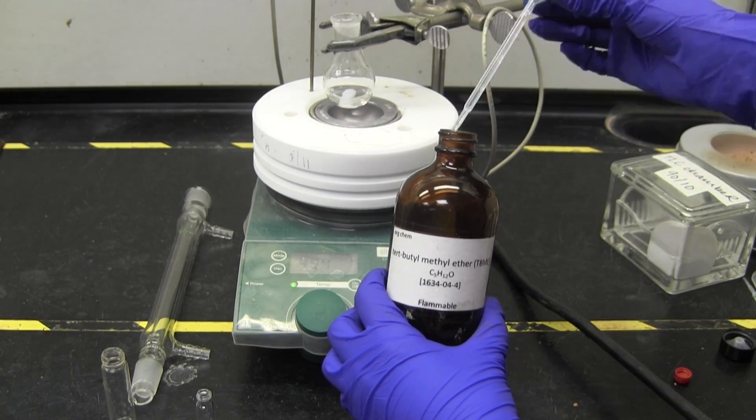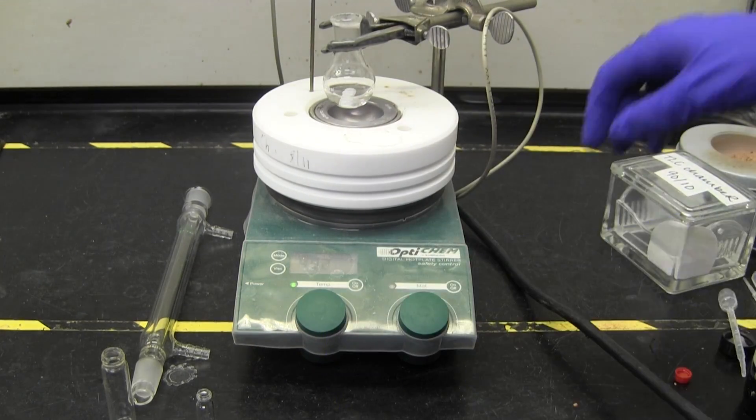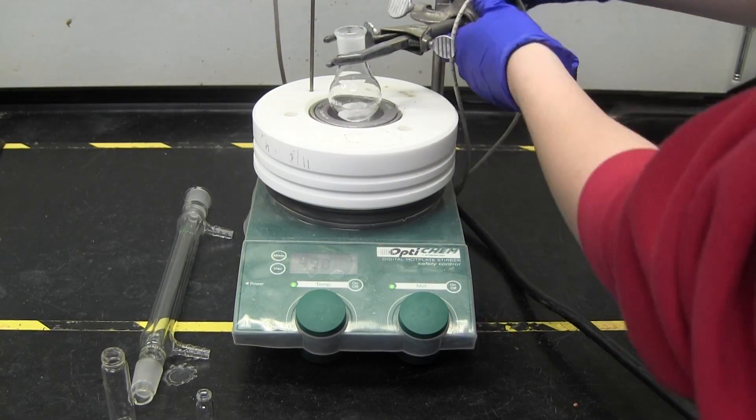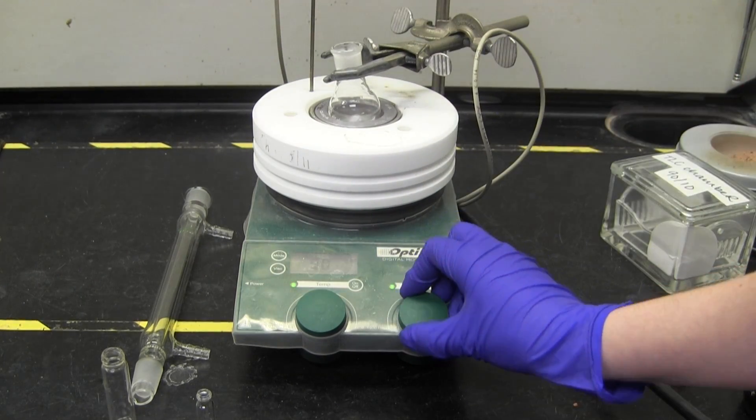Place the round bottom flask in a thermo well and attach an air condenser. Heat the reaction to 55 degrees Celsius and stir vigorously for 2 to 4 hours.